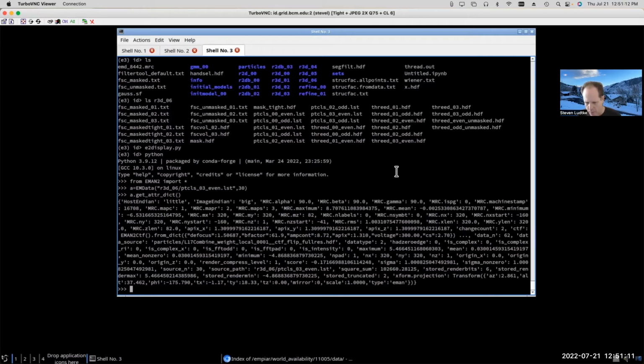Now, there's another way we can access these LST files. There is a class that EMAN2 provides for parsing LST files and interacting with them directly. If we treat this as an image like this, everything's fine. I can read all of the header information. But if I want to create a new LST file, which consists of this extra metadata plus the original image reference and stuff like that, I don't want to just say write image with this, because then that's going to write the image data back to disk. I want to be able to just handle the metadata.